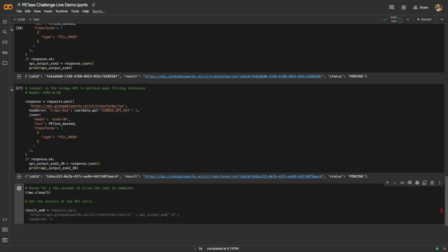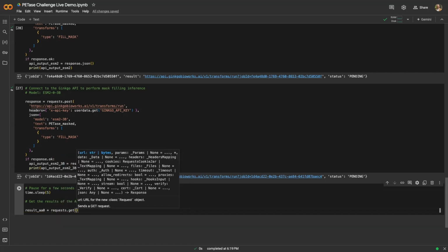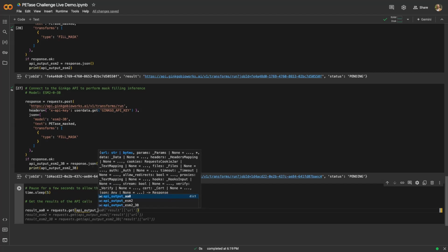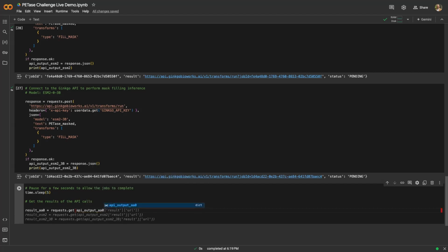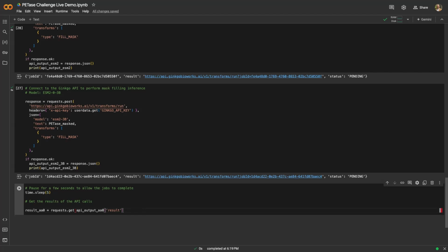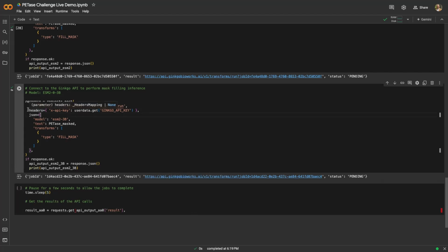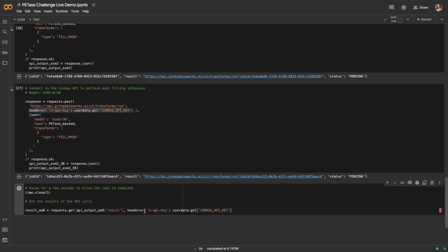For this, we'll use requests.get. We need to add this headers structure so that we are allowed to access the results.